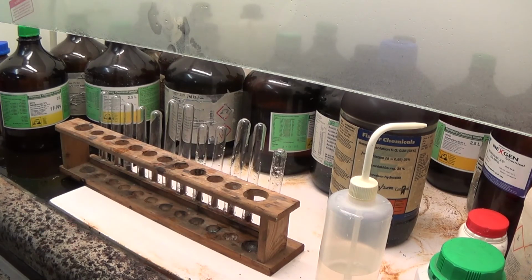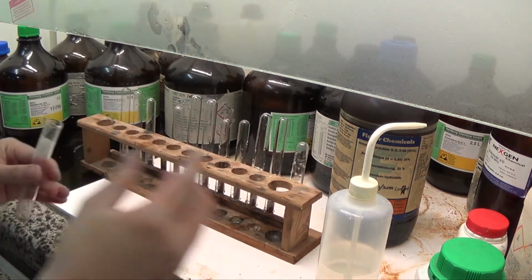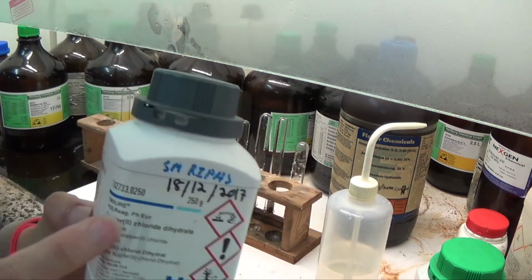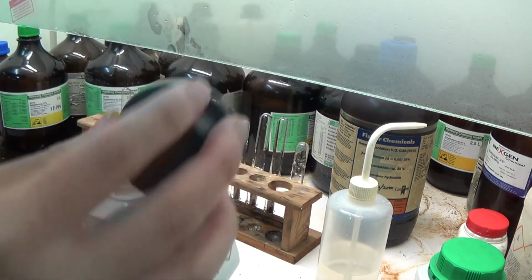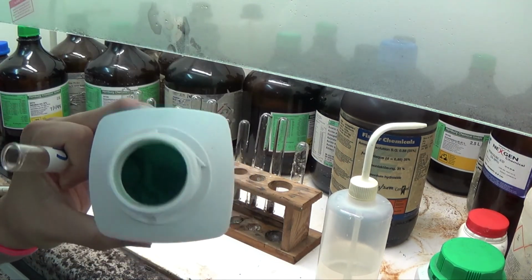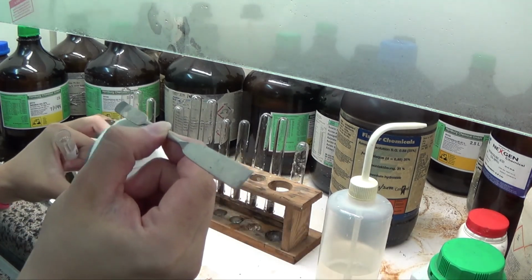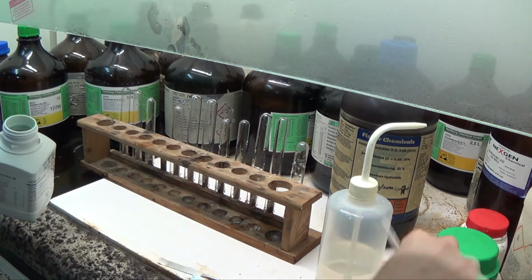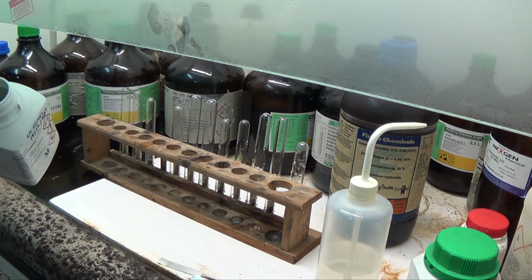Okay, so just to further drive home the message that we can get these compounds called copper 2 chloride dihydrate. So this is copper 2 chloride. It's kind of like blue greenish in color, but I'll just show you what happens when you dissolve it in solution. So you should get a clean spatula. Yep, that's reasonably clean.